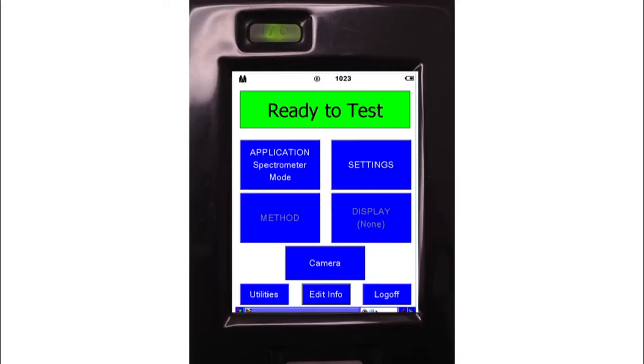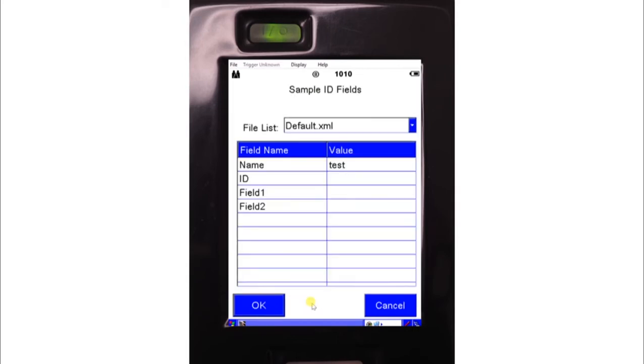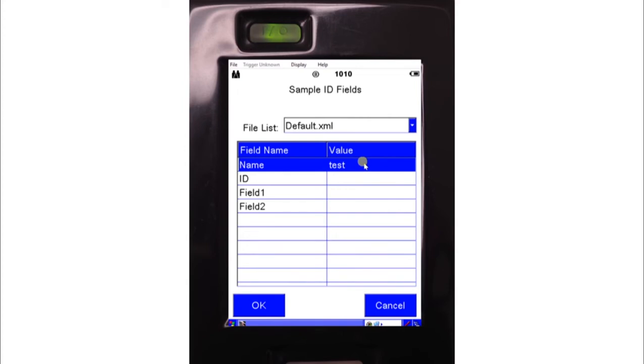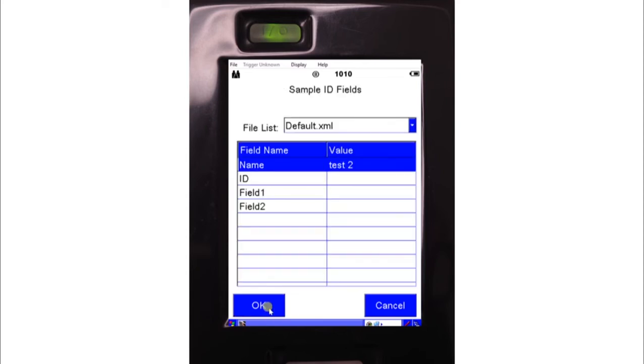To name your analysis, click on the edit info button on the main screen. Here you can change the name of the analysis and any other fields you would like. Double click or tap the sample name to change it. Click OK to accept changes and OK again to return to the main screen.